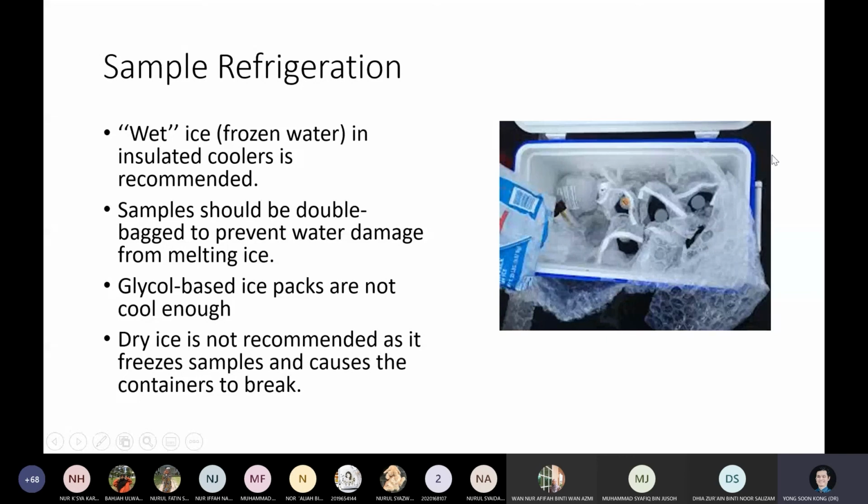So this so-called ice box, inside here they have a lot of ice. Once they fill it with ice, they also pour water. They won't pour it very full, but every single bottle has to be completely immersed, rendam betul-betul lah all the bottles.